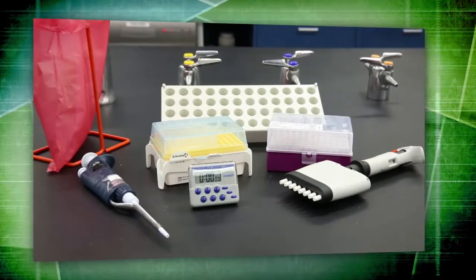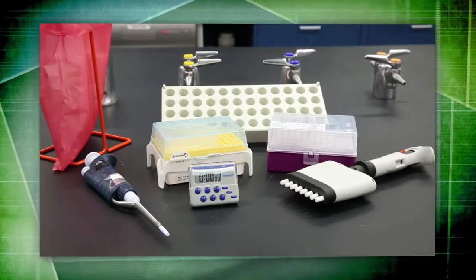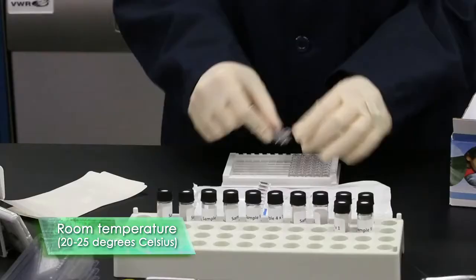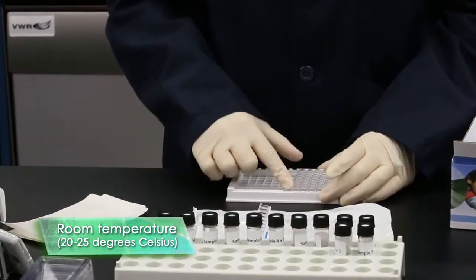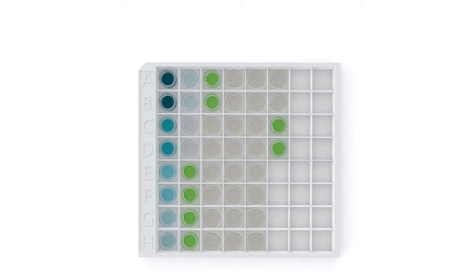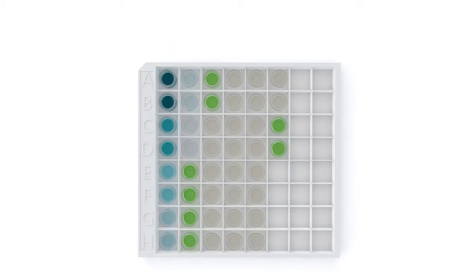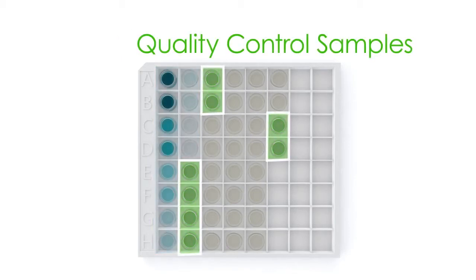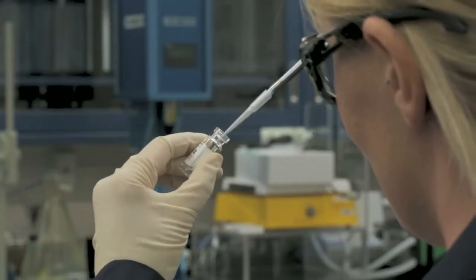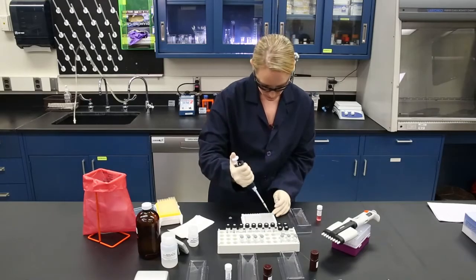Organize the ELISA equipment, including a 10 to 100 microliter adjustable pipette and a 300 microliter multi-channel pipette. Bring the plate, reagents, and standards to room temperature, 20 to 25 degrees Celsius. Dilute the wash solution concentrate according to the manufacturer's instructions. Please refer to the Ohio EPA method to learn how to perform the quality control and calibration steps. Determine the number and type of quality control samples before following the manufacturer's schema for plate setup.